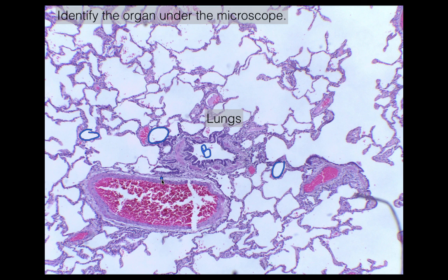The bronchioles have that deep purple epithelium. The arterioles are either going to be filled with red blood cells — which is what we see here — or empty. What you're missing in the arterioles is that deep purple epithelium; that's not going to be present in the arterioles. So those are our arterioles.